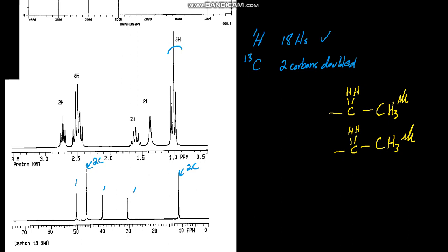Elsewhere in the spectrum, there's a 2 hydrogen singlet. Ooh, this sort of jogs my memory from the last problem. I said oxygen and nitrogens with hydrogens are usually not split. Those hydrogens are not split usually. So a 2 hydrogen broad singlet is probably an NH2 in this problem, almost has to be. It agrees with the IR, it agrees with the formula, and the NMR. So that means the other nitrogen might not have hydrogens on it.